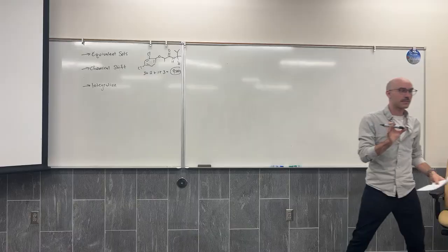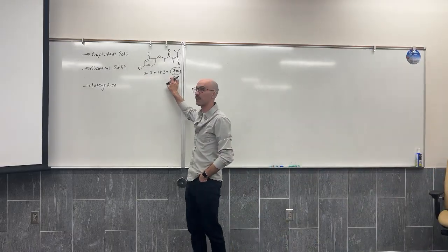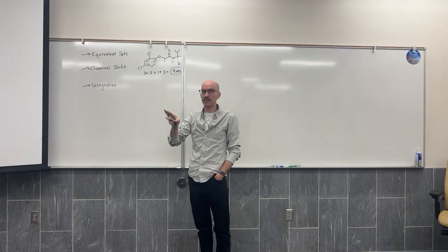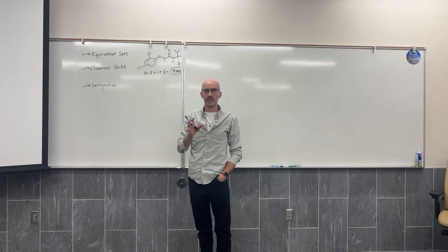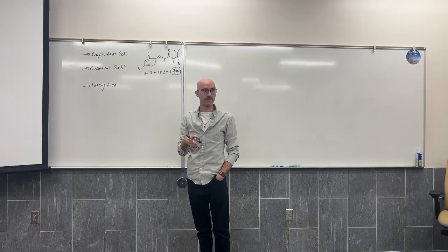And then we said, despite the fact that we think we should find 9 different signals, 9 different sets, some of these signals overlap with each other. So they might be different, but still similar enough. And you're okay with that as well? That different hydrogens give different signals that just coincidentally happen to be the same.